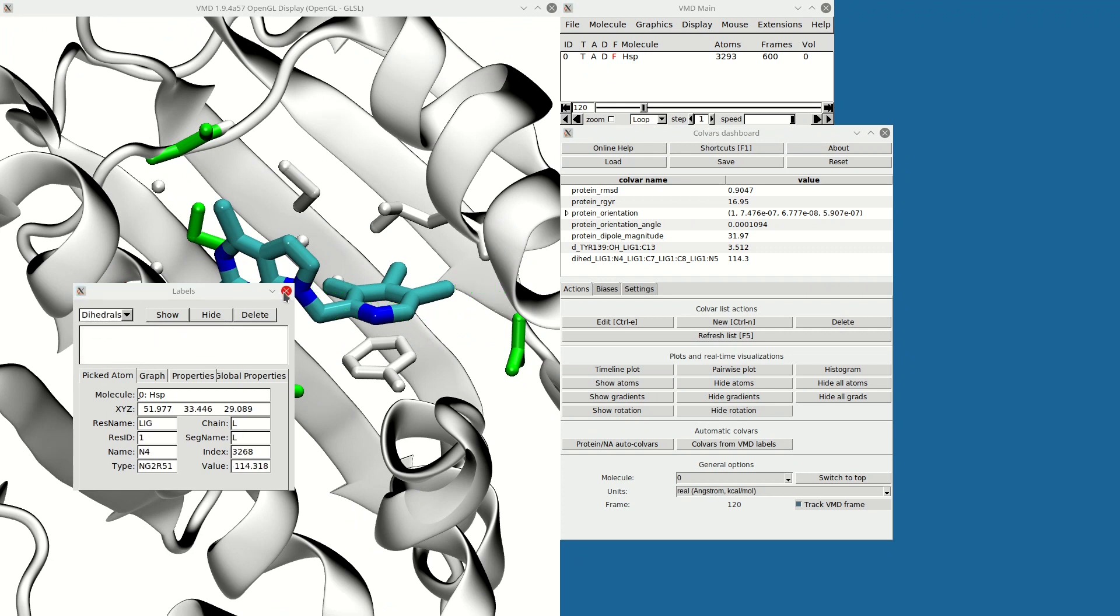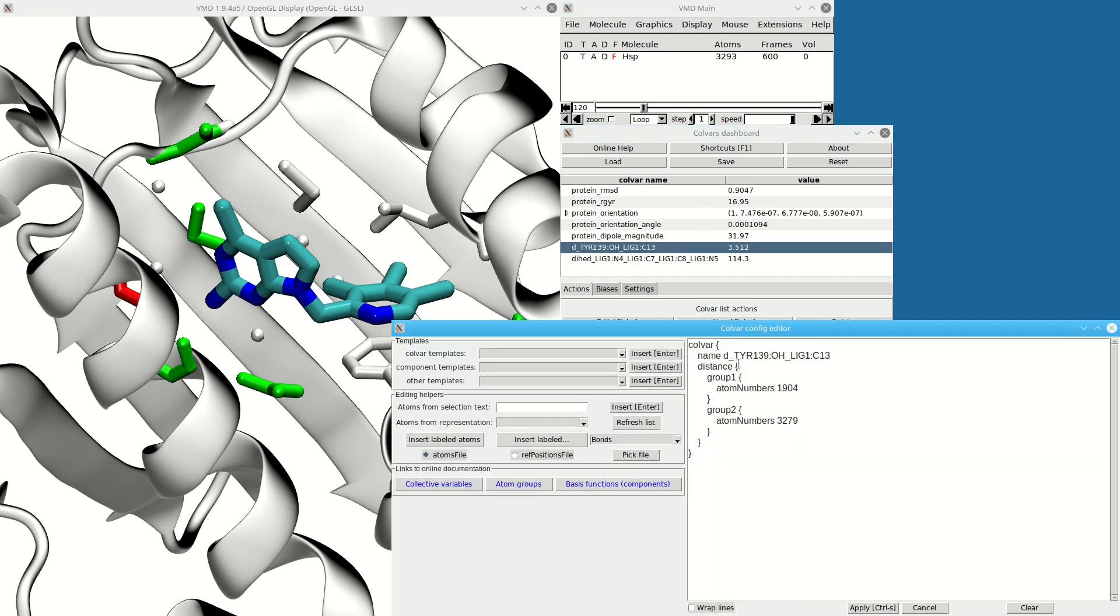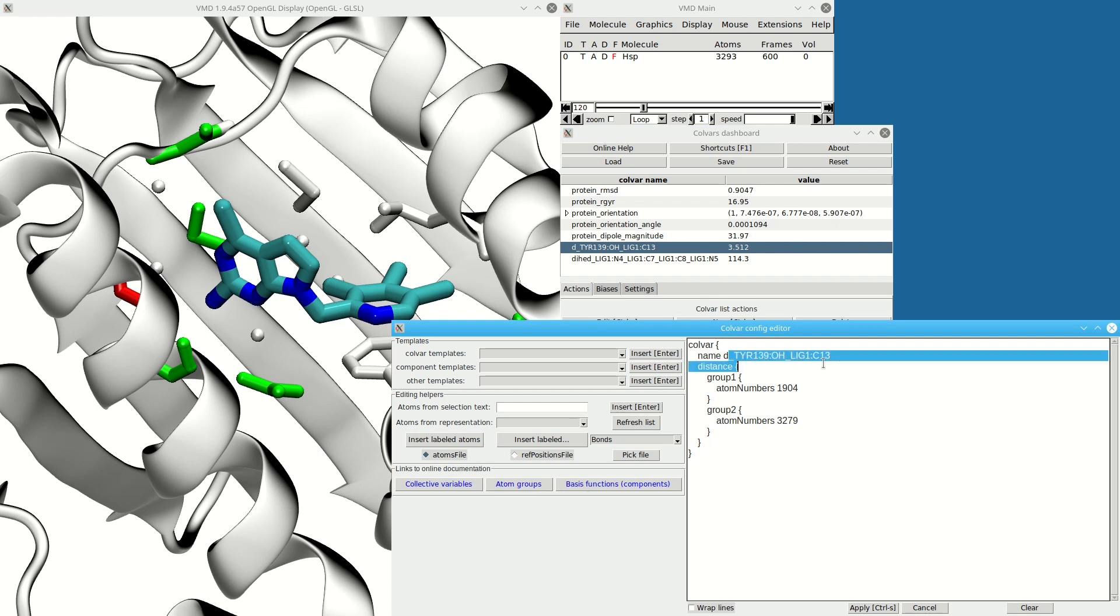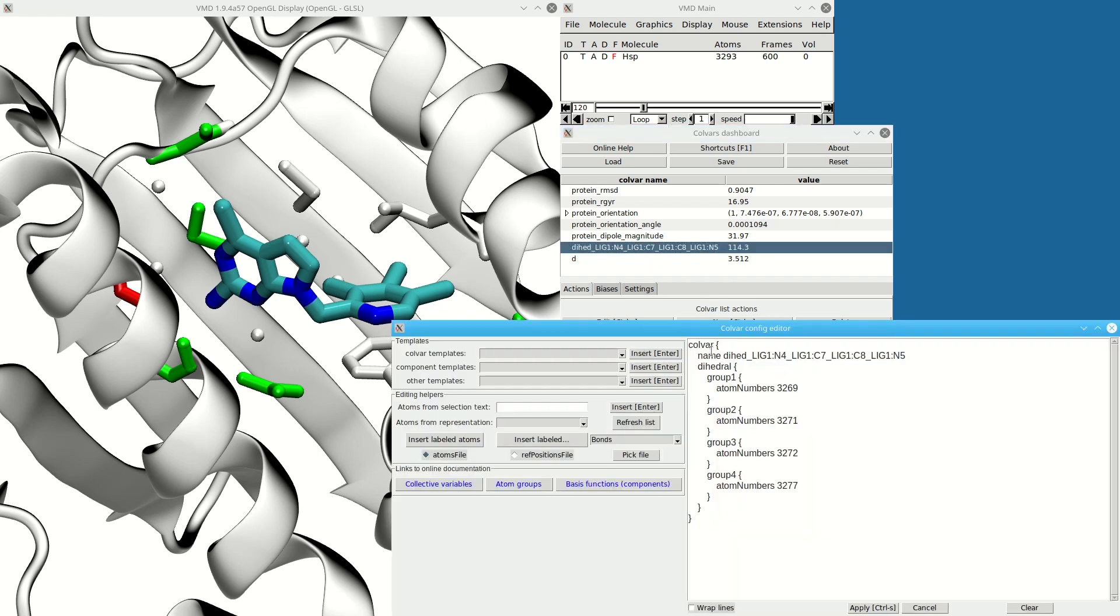These names are a bit cumbersome, so I'm going to change them. I double-click on the name—this opens the Colvars config string. I can change the name, Ctrl+S to apply. Then for the dihedral, same thing: change the name, Ctrl+S.